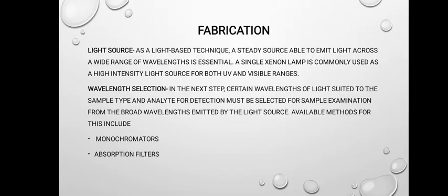The first one is the light source. As a light-based technique, a steady source able to emit light across a wide range of wavelengths is essential. A single xenon lamp is commonly used as a high-intensity light source for both UV and visible ranges.